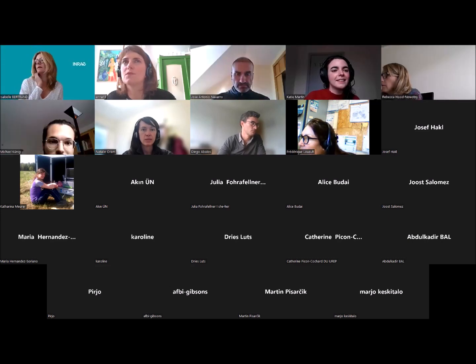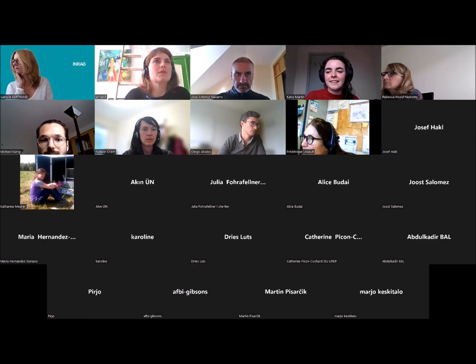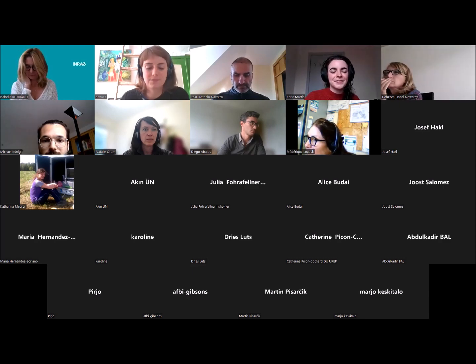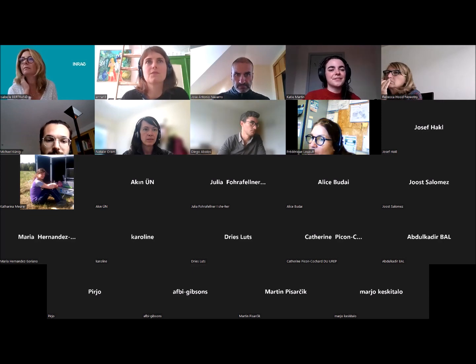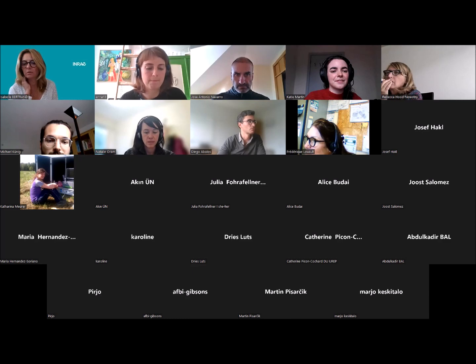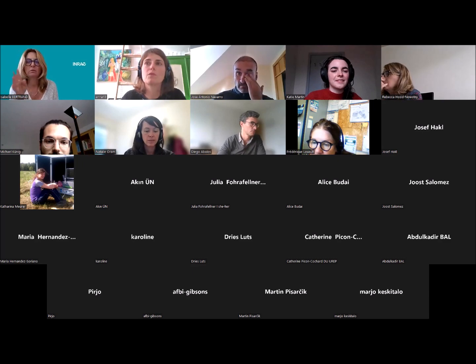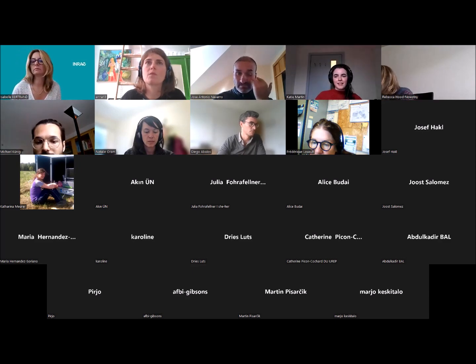And I got one, Isabel, if you don't have another. Coming back to the first presentation, Katie, when you were comparing WinRhizo and RhizoVision, maybe I missed the information, but what resolution were you working at? Because in the talk just after, we had 600 dpi. Was it the same? Did you try several resolutions and compare the relationship again or not? Yeah, I also used 600 dpi.